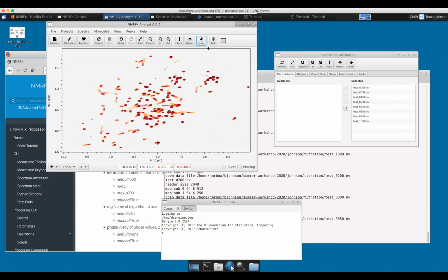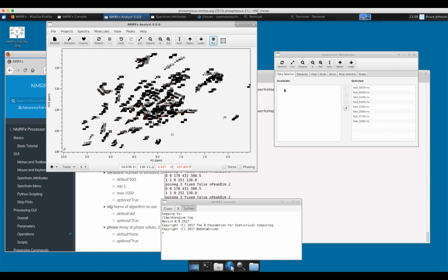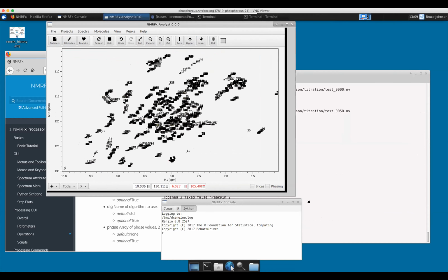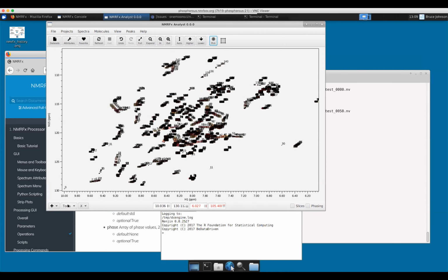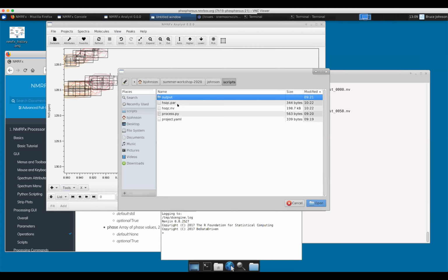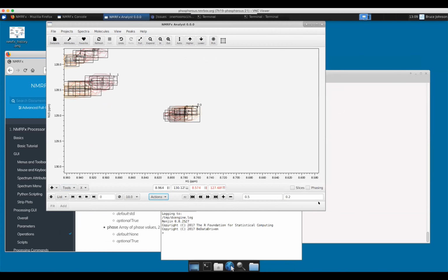Okay, so I'm back there. So let's do pick. We've loaded the spectra, we've peak picked them. You can still resize, so I will. I'll come down here, peak path tool, my actions, I'll load my titration data, Johnson titration, ligand concentration, open, come over here.